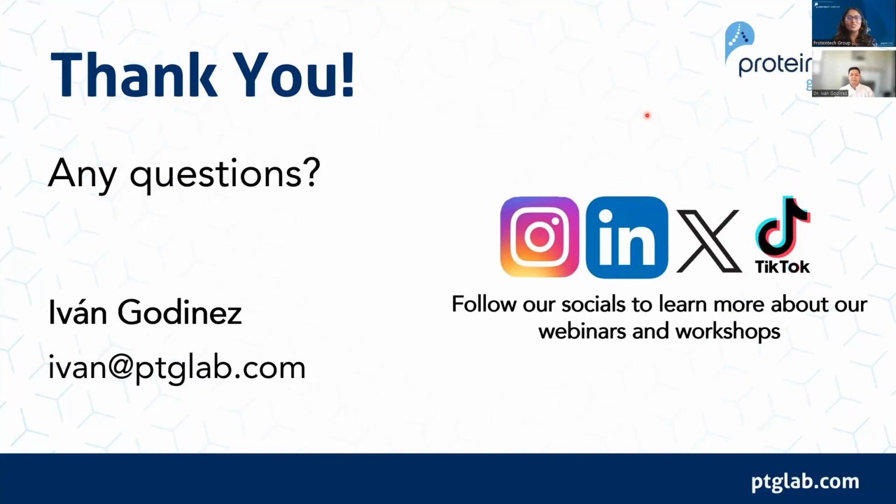Our next question is, do you need to fix and permeabilize the sample prior to adding your intracellular antibodies? Yes. So that initial 15-minute fixation provides the cell enough structural integrity so that when we subject it to detergent, it doesn't fall apart, right? So you do the fix, which makes the cell into, as Peter Smibert says, little rocks. And then you do a little soap, and that permeabilizes them a bit, and that's actually what enables access to the intracellular domain. So without those two steps, you won't be able to get intracellular staining.